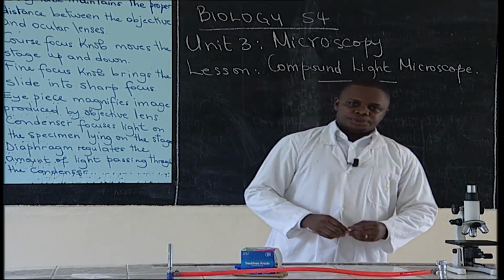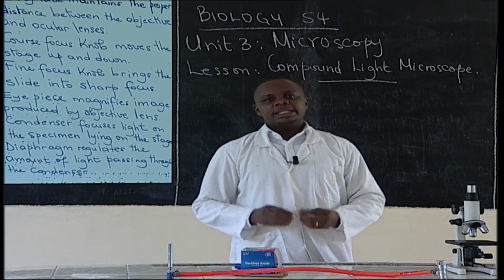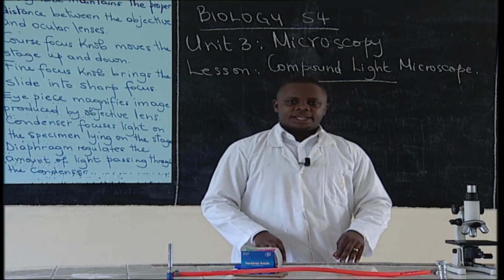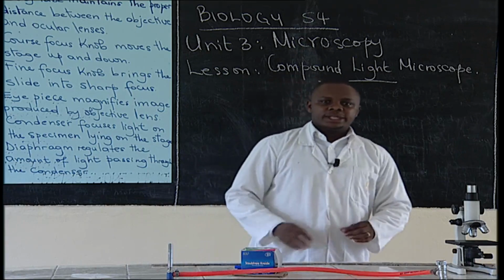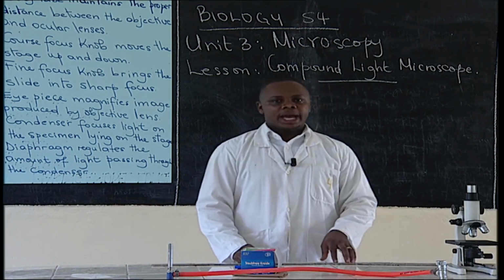Before we continue, do we need microscopes in our everyday life? Yes, we do, because we have seen some organisms are small and they can't be seen by our naked eyes.